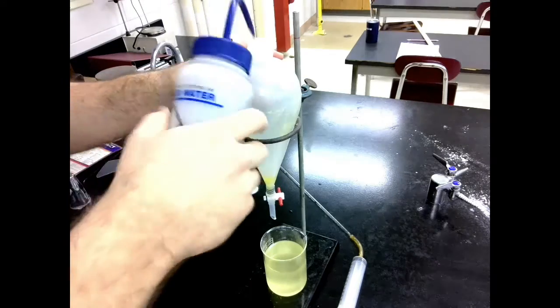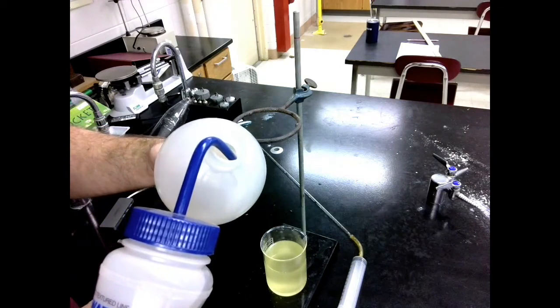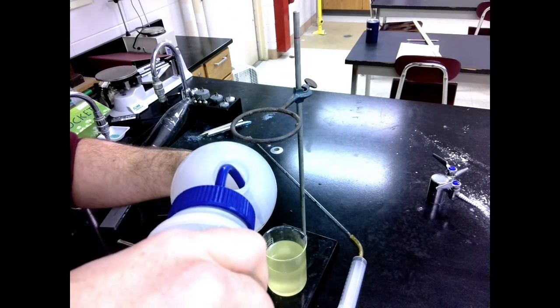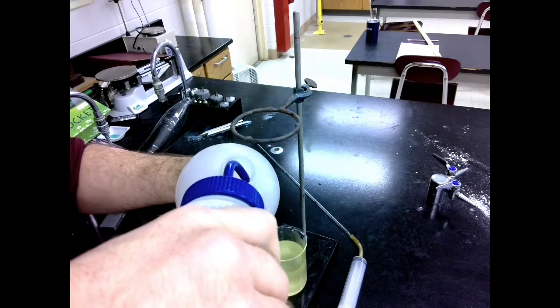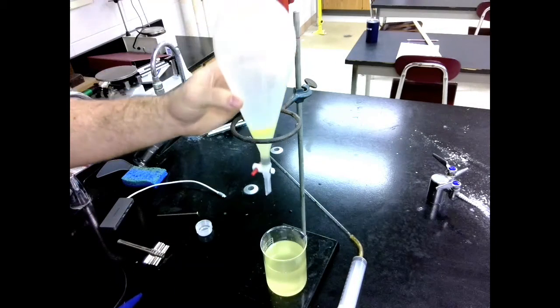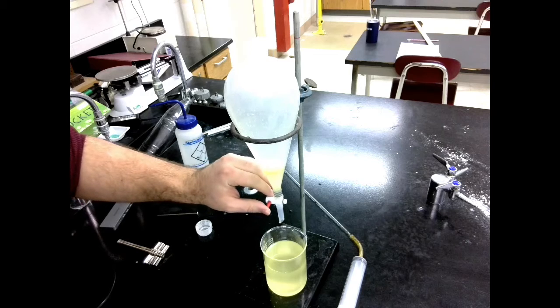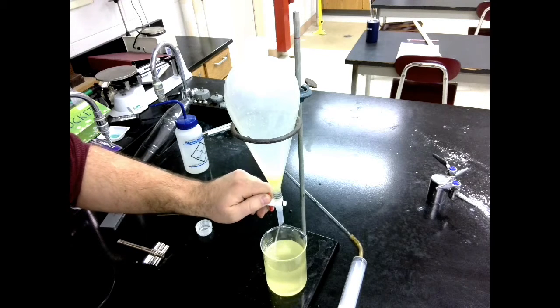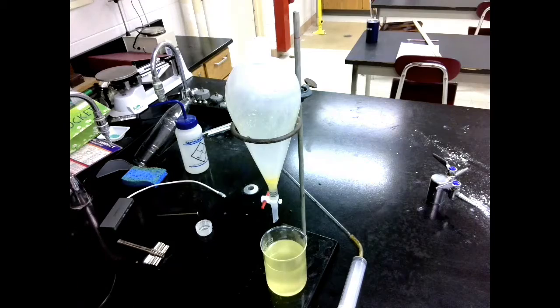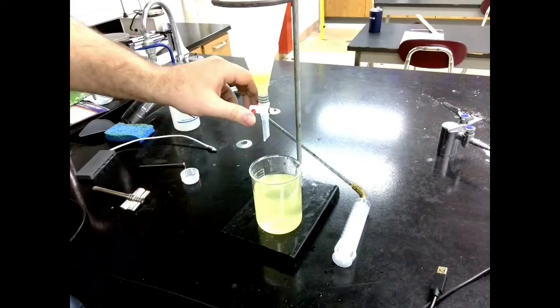Now this is going to put a little bit more water in here, but that's fine. Might be easier to take it out and run it just like this. All right. So now most of my oil has been washed off the side. I can drain out that last little bit of water. I might need to give it a little bit more time to separate again. And then once it has separated, I'll take out that last little bit of water and collect my oil.